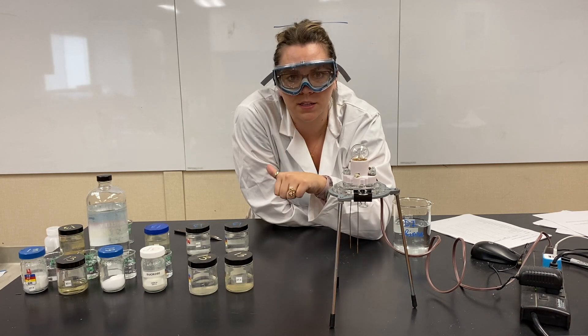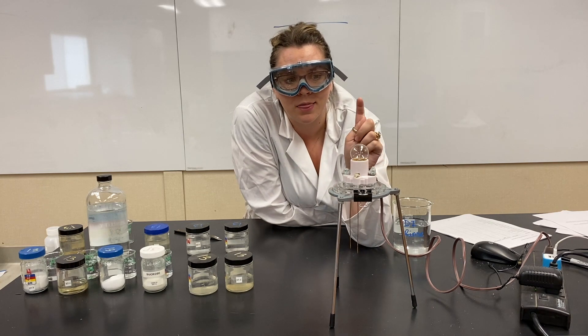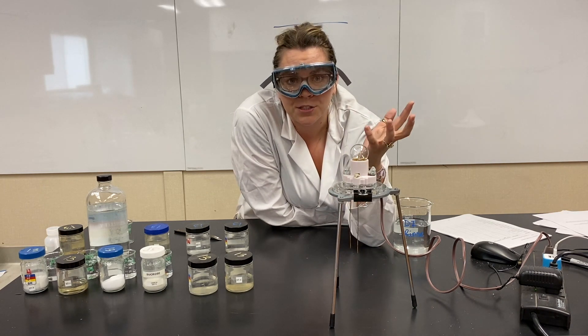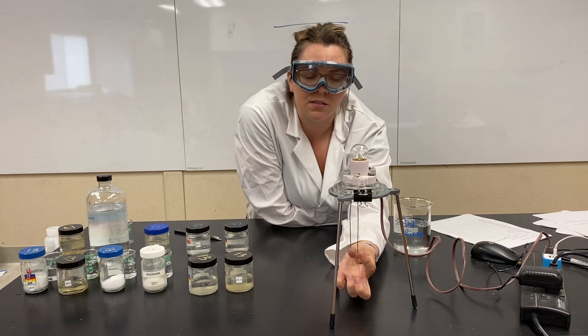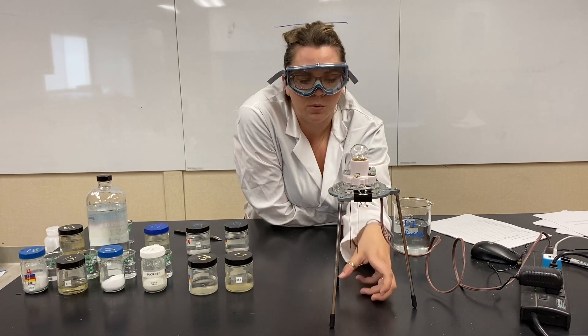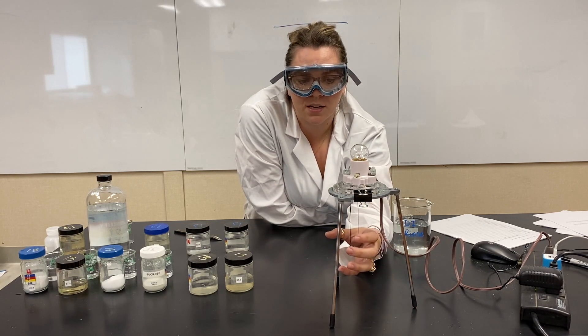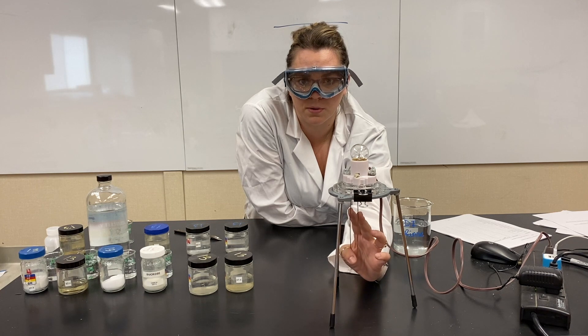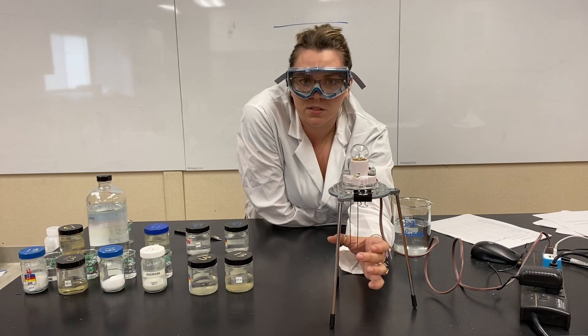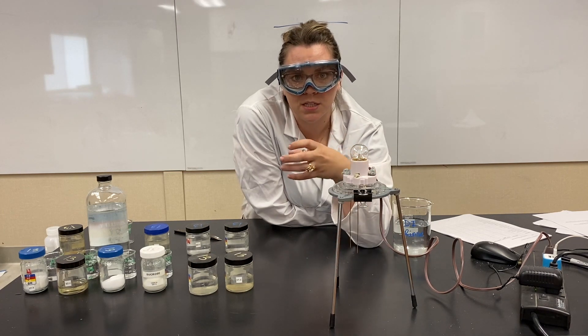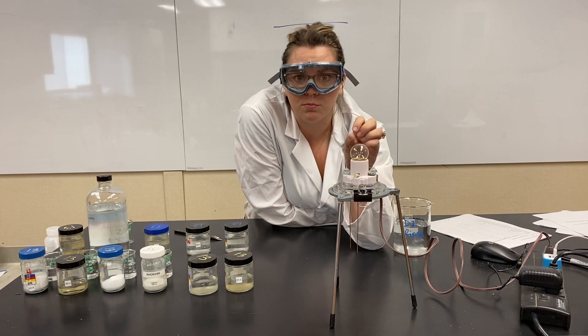And the stronger the electrolyte, the more electricity that will be conducted through the solution. So that means the brighter the light bulb. The way we actually get to test this is this is a light bulb that has the circuit disconnected. The circuit is open and we're going to close the circuit by putting these different solutions underneath the two parts of the circuit that are open and we're going to connect them with the solution. If the solution is a good electrolyte, is a strong electrolyte, that light is going to light up really bright.